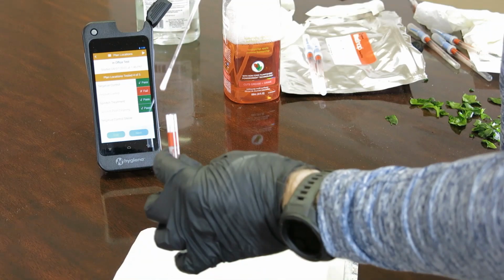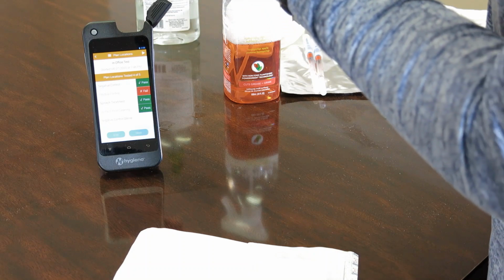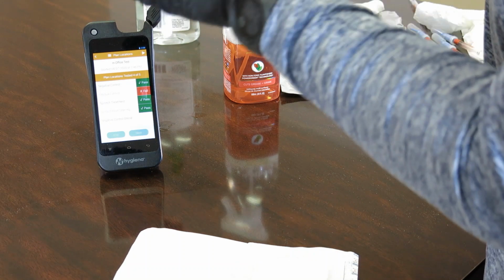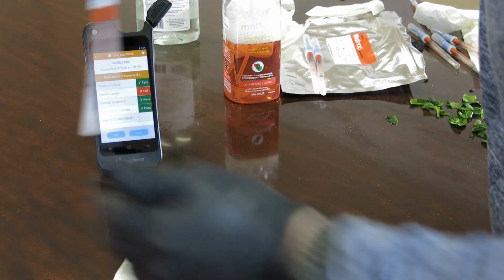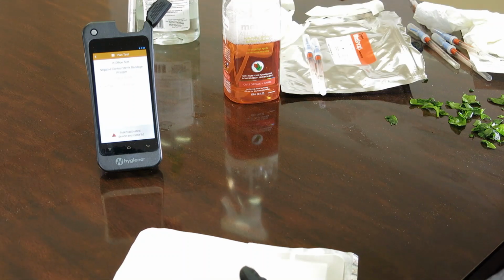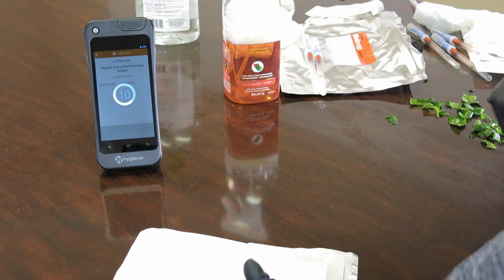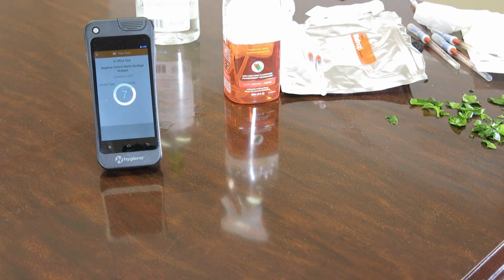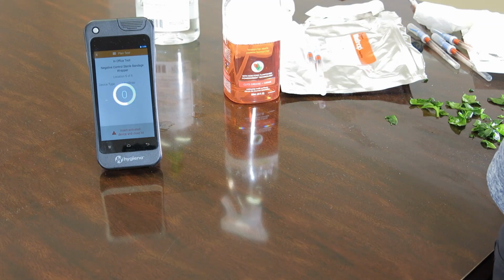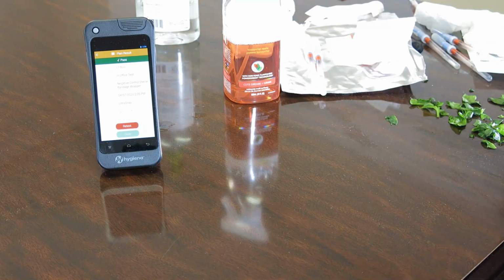Let's do this. Put it back in here. Break these off. Squeeze it in. Little swirl, go to our next test right here. In, close the door, run the test. And we got 17 RLUs on this one too, which was the same as the cleaning surface.